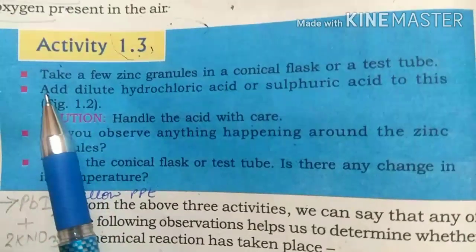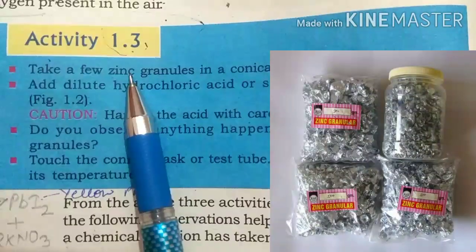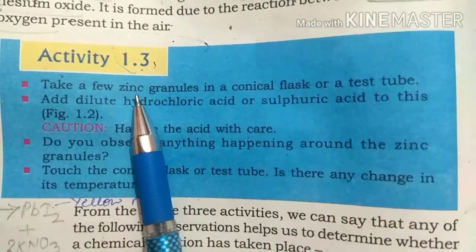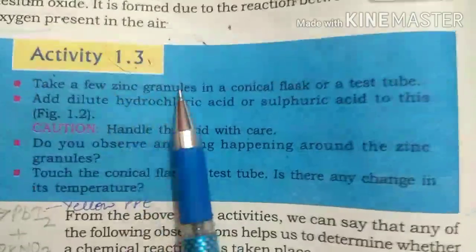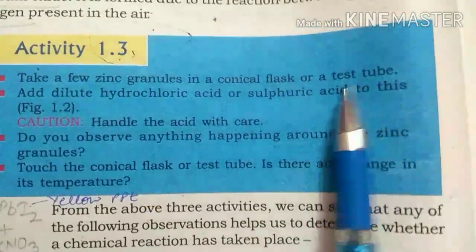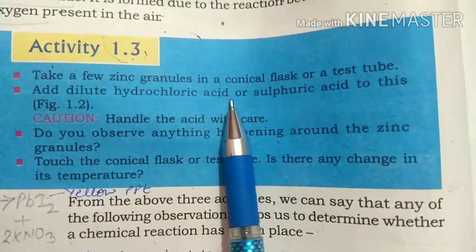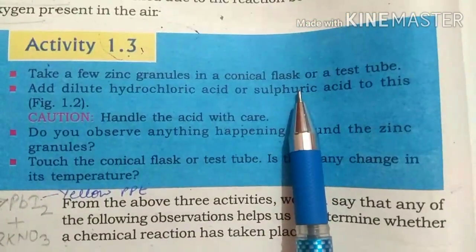Now, in this activity, we will take zinc granules. Zinc is a metal. Granules means very small pieces. You know that metals usually exist in solid state. So these are the solid small pieces of zinc. We will take them in a conical flask or a test tube. Then we will slowly add dilute sulfuric acid or hydrochloric acid. We can use any one acid.